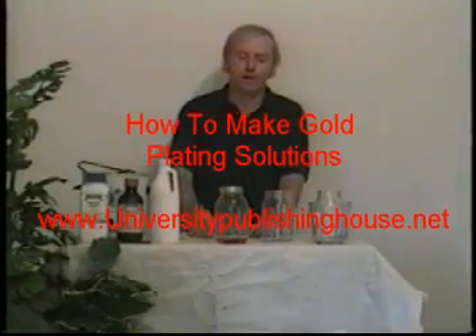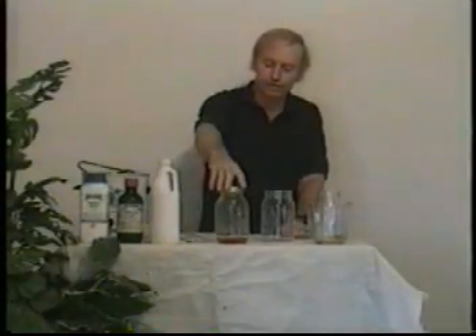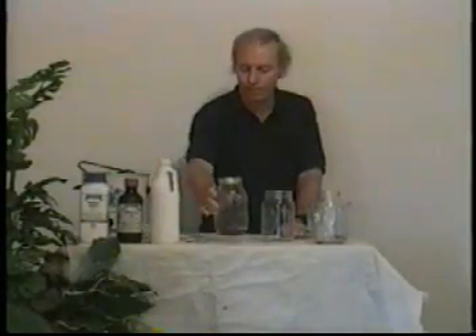Okay, let's make some gold plate solution. Now what I've done — I cut a one-tenth ounce maple leaf coin into thirds, and I put just a piece of metal in an ordinary bottle like this.